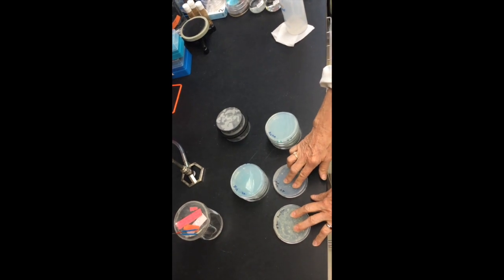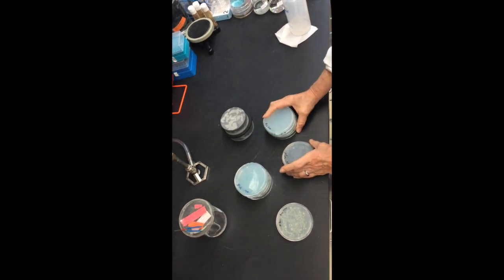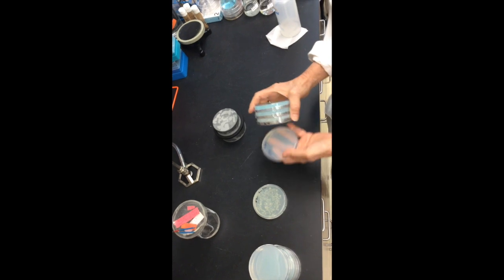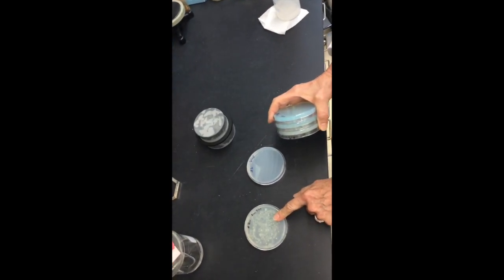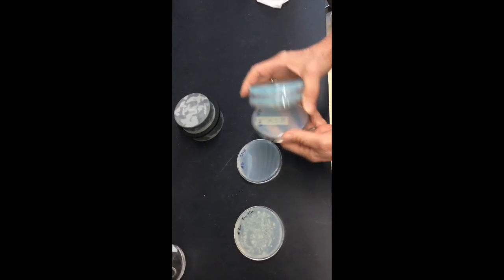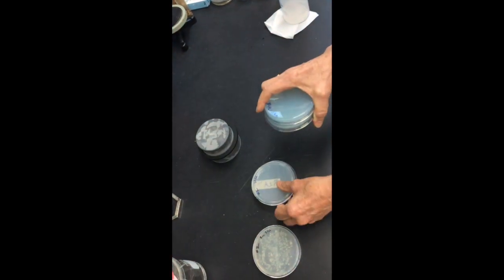We want to see whether there are any organisms that grew and produced colonies on these plates that will now grow in high concentrations of copper. So with each of these series, I've labeled some other plates. We've got one control, which will be the same medium, called R2A, with no copper, and then we've got some that have 0.5 millimolar copper.